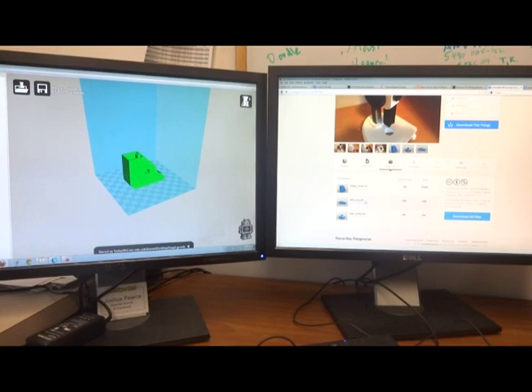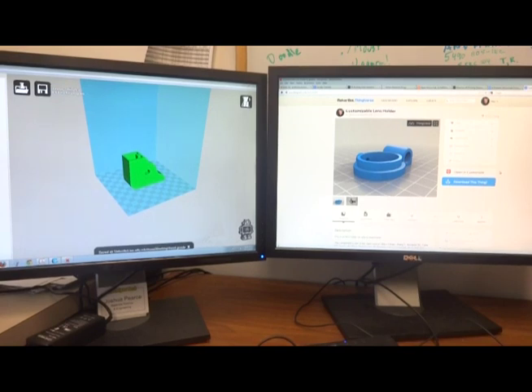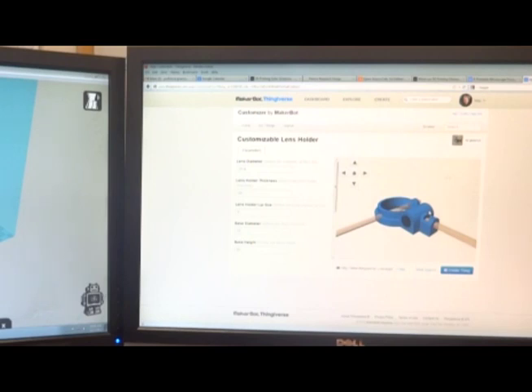You pick the one you want, download it, and it's set up ready to print. For something like this customizable lens holder, you can open it in Customizer — an application that allows you to make it exactly what you want. So if the default thickness is 10, maybe you want it to be 12, and you want the lip size to be a little bit larger. You can change all these things, or change the diameter of your lenses if you've got larger lenses.